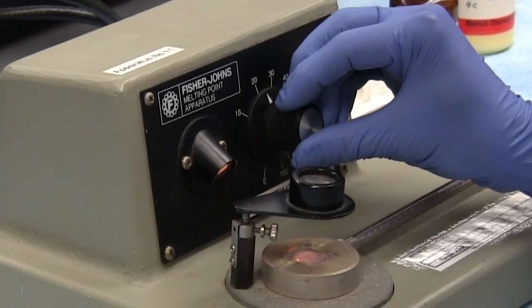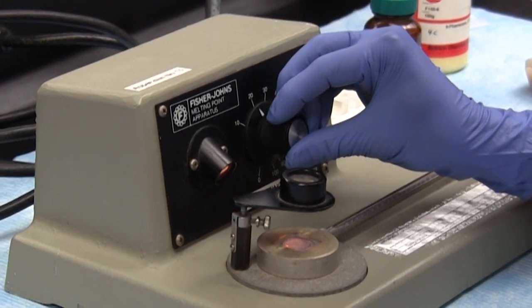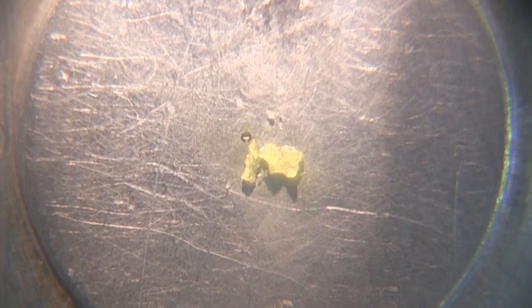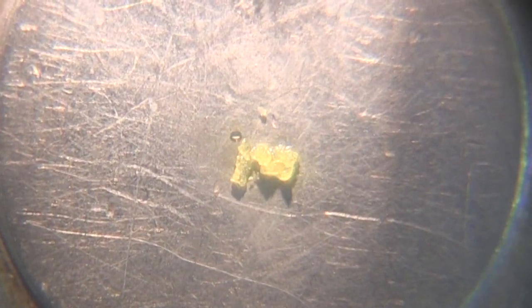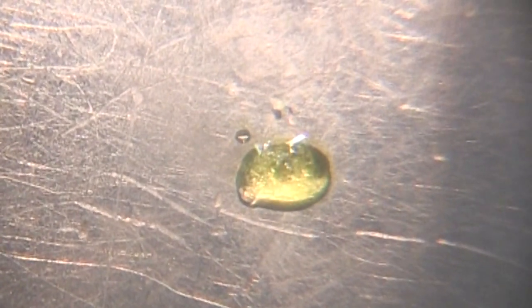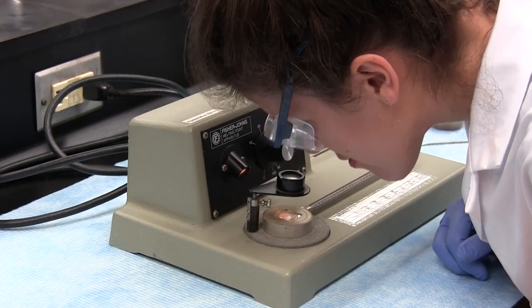Now, melting point is one of the main physical properties in preparative organic chemistry, because the melting point of a compound can give us important qualitative information regarding the purity of a sample synthesized in the lab, and it can also help us in identifying a chemical compound.